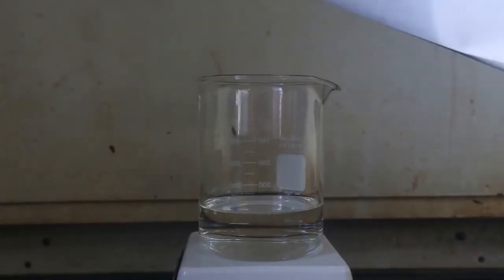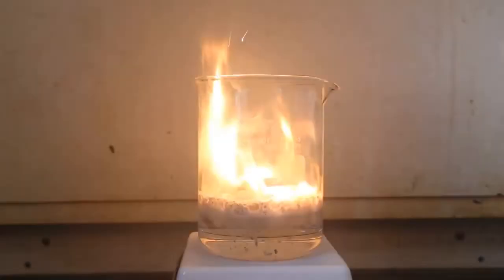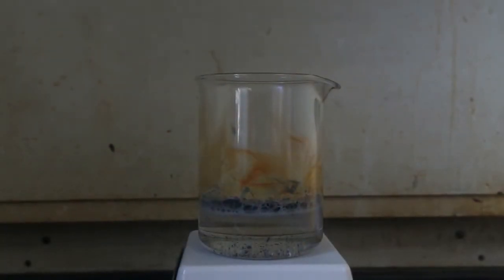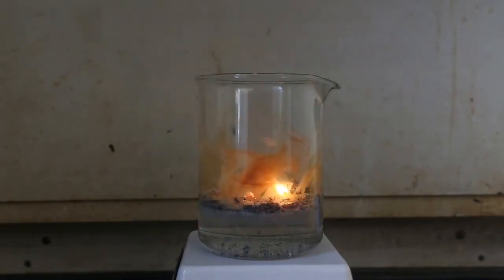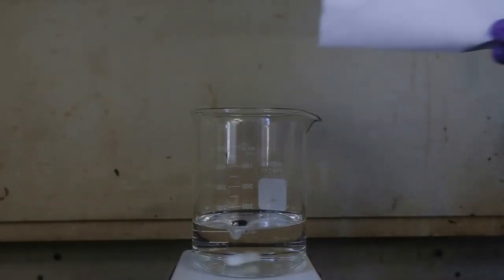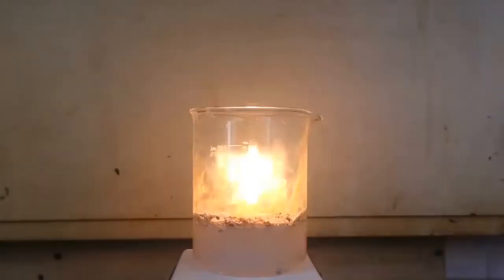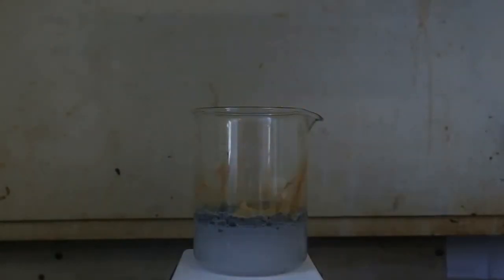The use of silica gel allowed for a much better yield of magnesium silicide. The above reaction is much more violent, and only half of the product was used. The silica gel gives a much better yield due to its smaller mesh size, but the preparation is much more dangerous. This is the second half of the magnesium silicide reacting. As with the addition of the first half, the magnesium silicide seems to react quite violently upon addition and then die out quite quickly.